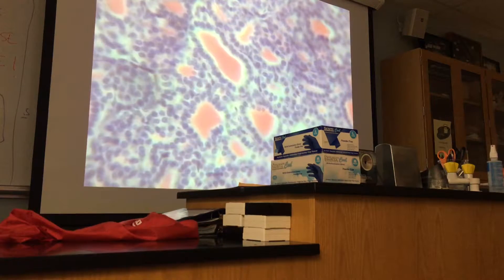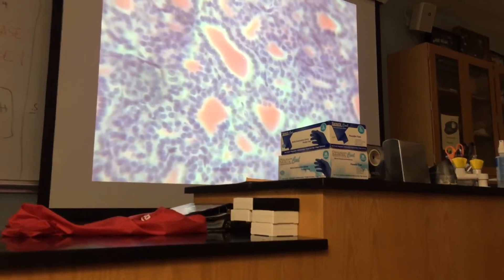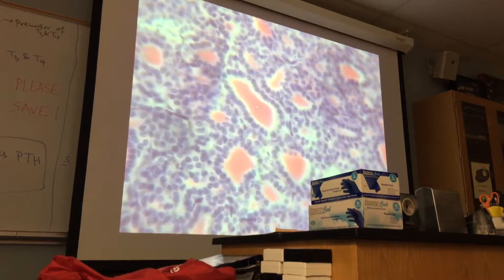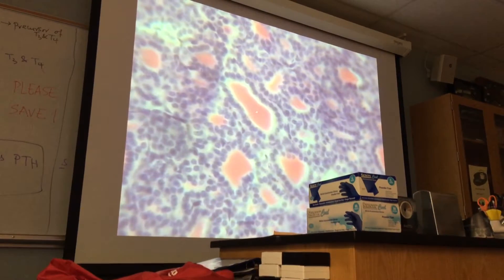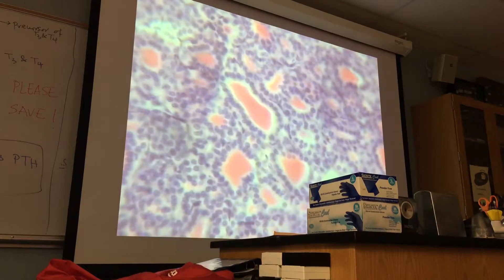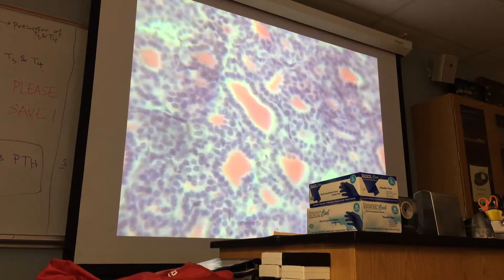What is this here? This colloidal substance — you can call it colloid. Colloid contains thyroglobulin, a protein pool.